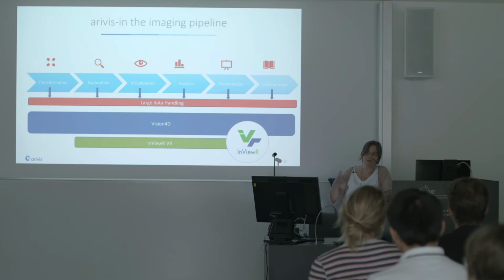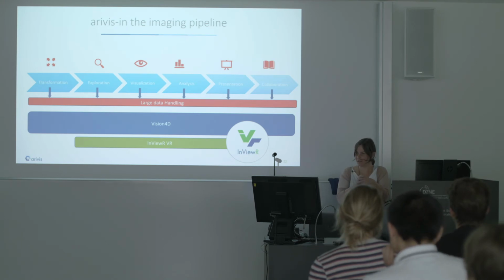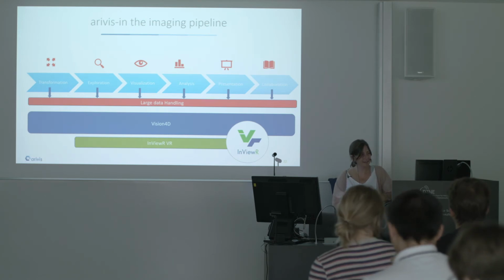So we will show you later in the software, I think. But I would be very curious why you would want to do this. So I guess you would want to do that in a certain region for a certain staining. So let's show you that later. When you have your measurements ready, I think there's also a way to export this into a spreadsheet.